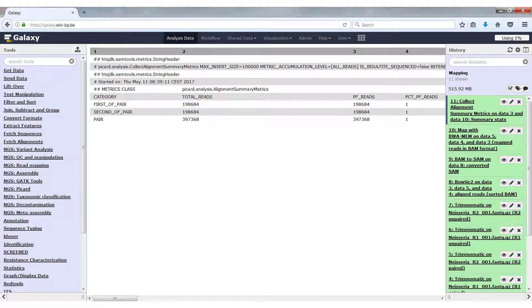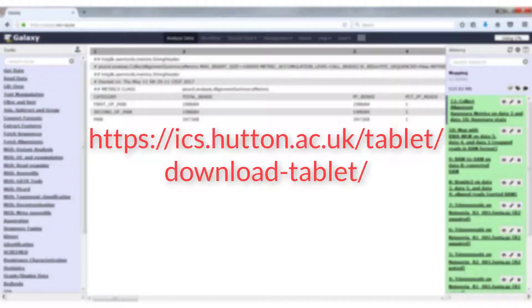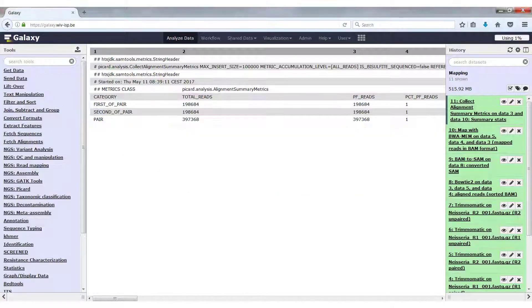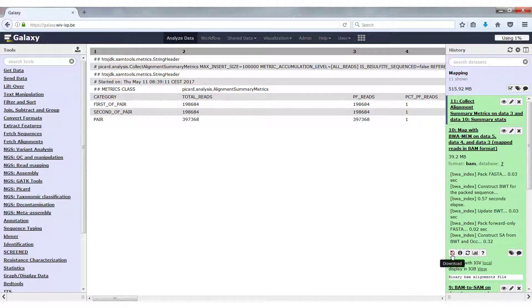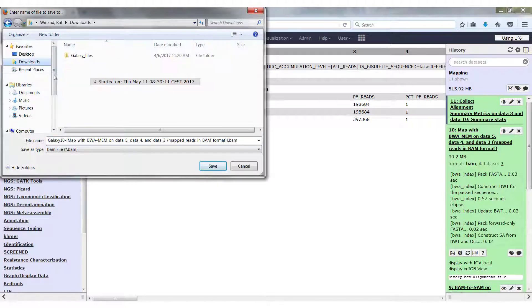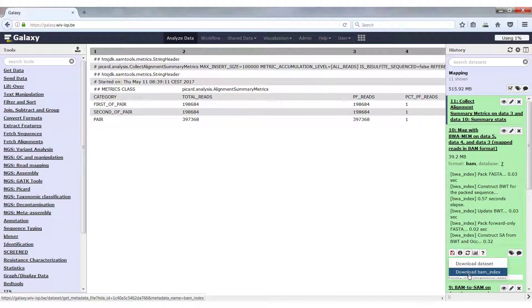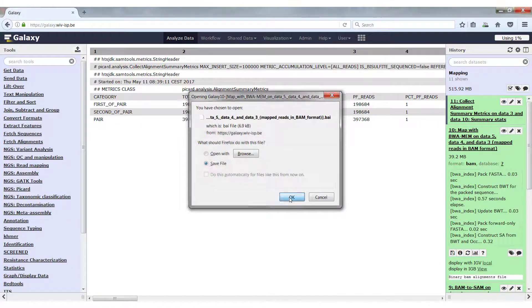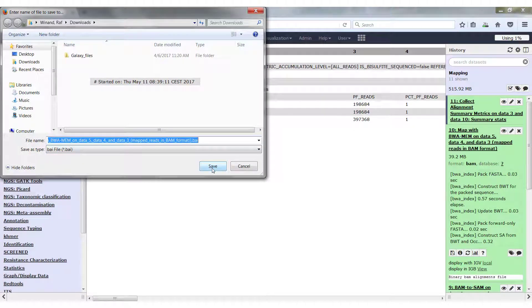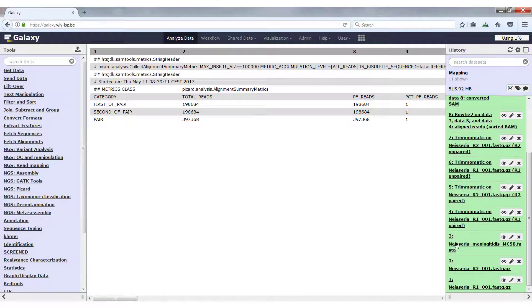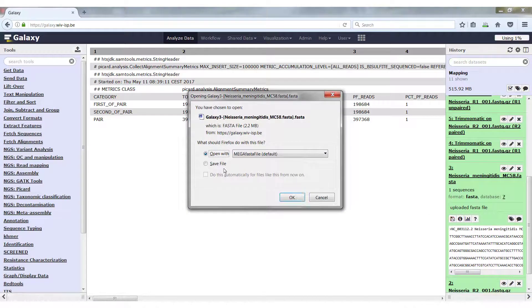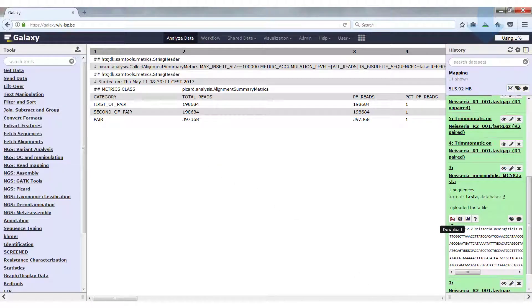We can also visualize our mapped reads with a tool called Tablet, which is available in a software catalog or can be downloaded and installed on your local drive. To visualize our mapped reads, we have to download the BAM file and the reference file. We go to our BWA-MEM mapped reads, click on the Download icon, and first download the dataset, saving it to a known directory. We also need the index file, so we click Download again and download the index — both files must be in the same location with the same name but different extensions: .bam and .bai. Then we scroll down and download our Neisseria reference FASTA file to the same directory.